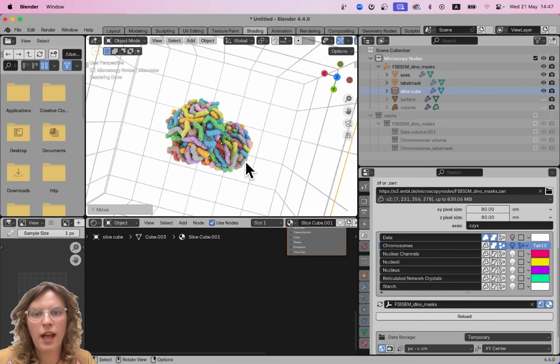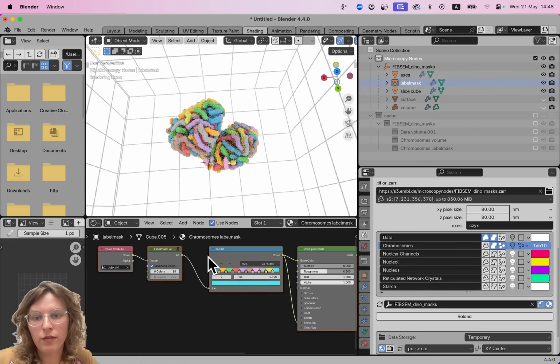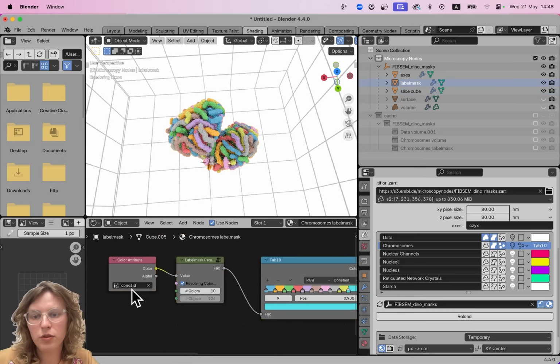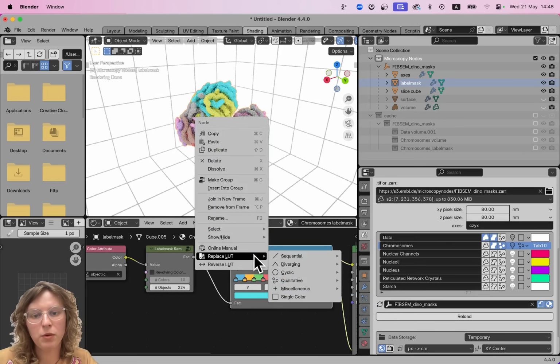And then we can, for example, color or animate based on the object ID of certain objects. So if we go to our label mask, we now see that we also have our tab 10 color mask. This reads out the attribute object ID, and then it has a revolving color map. The other option is that it actually just ranges from 0 to 1, and that makes a bit more sense.